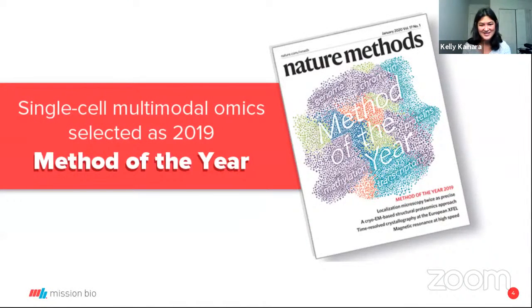So multi-omics is hot, especially on a single cell level. Nature Methods called it the method of the year in 2019, and I think it's really exciting. Single-cell RNA-seq, the first commercially available product at a high-throughput scale, came out around 2016.